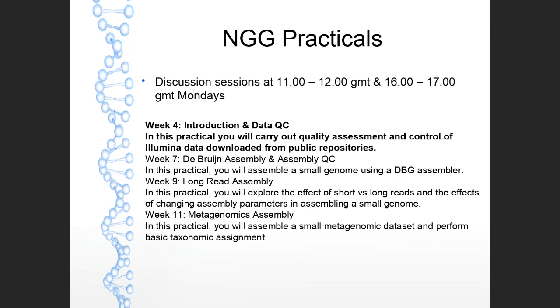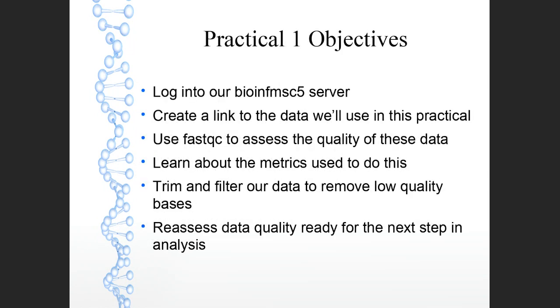Now, what do we mean by data QC? Well, we're going to go through several steps in this practical, and you'll see from the practical guide. The first objective, the first step, is going to be to log yourself into the Bioinformatics 5 server. Now, some of you will already have used this quite a bit already, but if you haven't done so yet, there are instructions to log into the server.